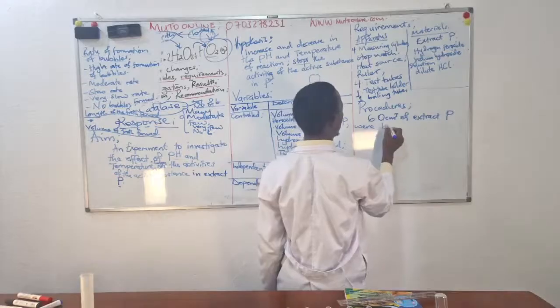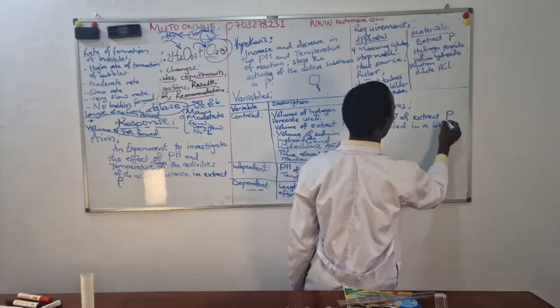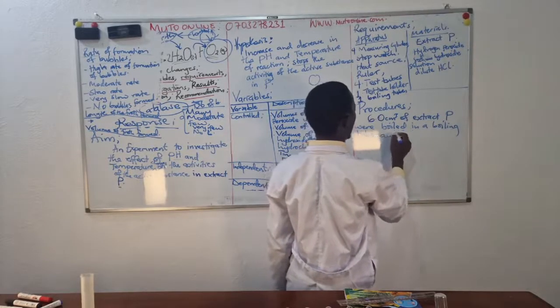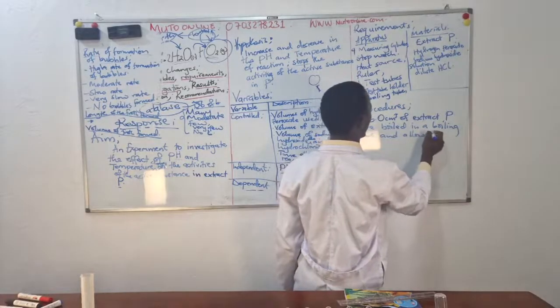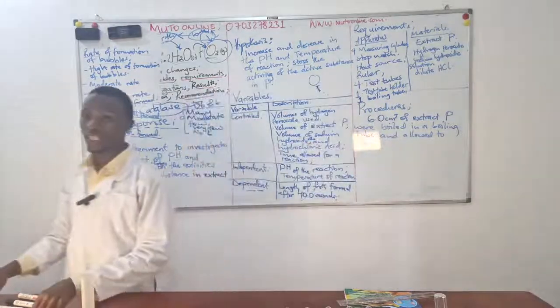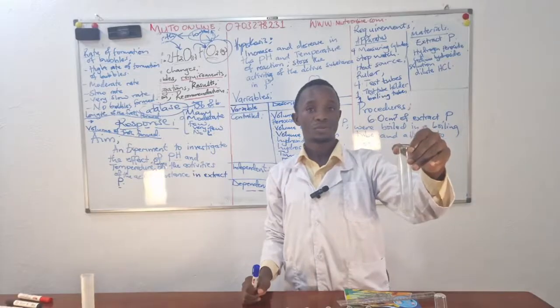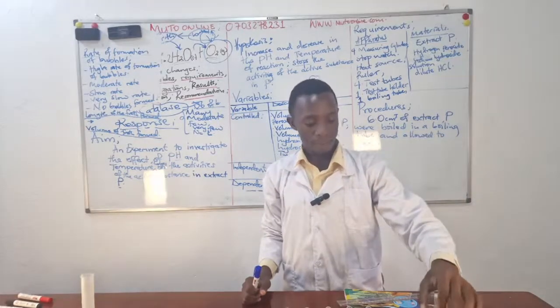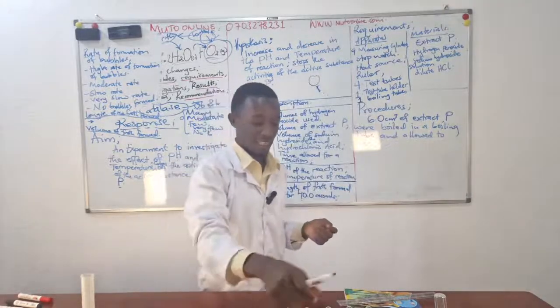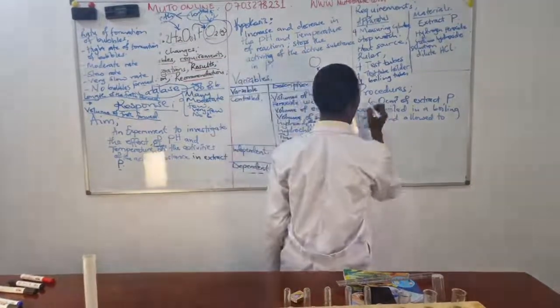were boiled in a boiling tube and allowed to cool. So I've started by boiling so that I can give this extract time to cool. Why? Because we cannot use a test tube when it is hot. Then I will prepare the test tubes.